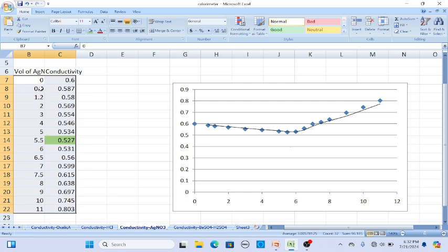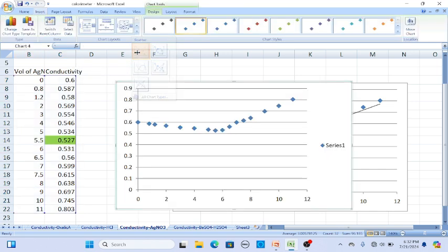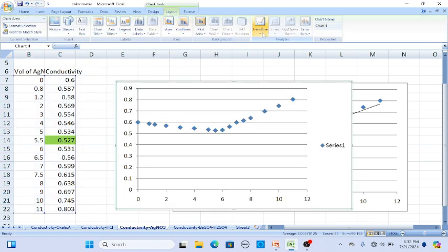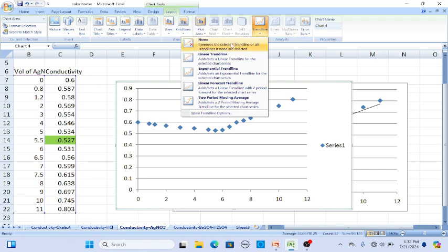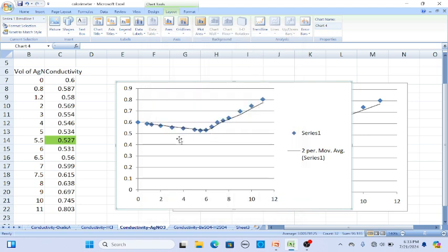Select both the columns — the left column will be your X axis and the right column will be your Y axis. Now go to Insert, then go to Scatter, choose these points, and this kind of graph you will get. Now go to Layouts and in layouts you can add the trend line. For this purpose I have used a two-period moving average. This kind of graph we will get — it is going first down and then increasing.